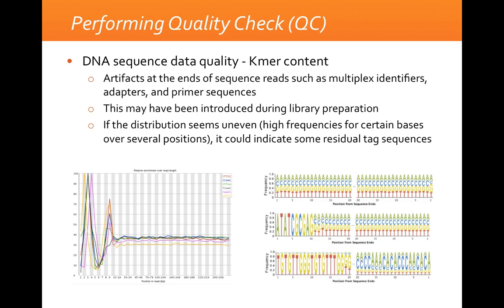So these quality controls can also look for sequence artifacts.